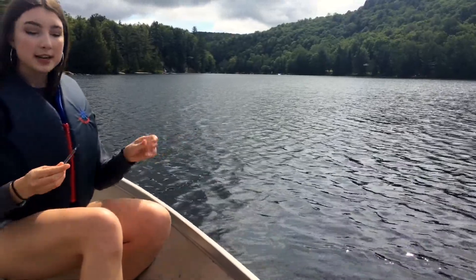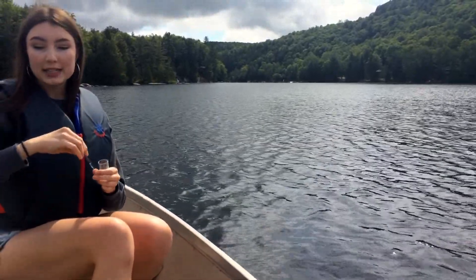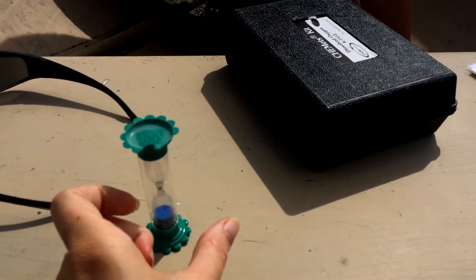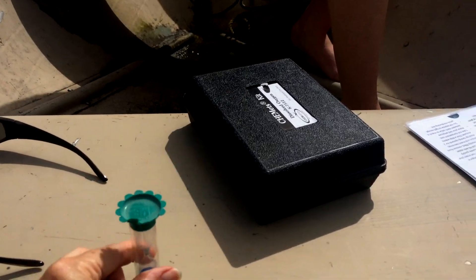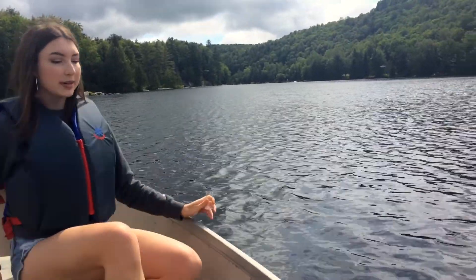As soon as you've taken it out, we're going to do the test, and then you're going to put a timer on for two minutes. This is also better to do with a partner — it makes it a lot easier. We have our minute timer, which we'll be using twice, and you'll wait the two minutes before we compare to get our actual reading.